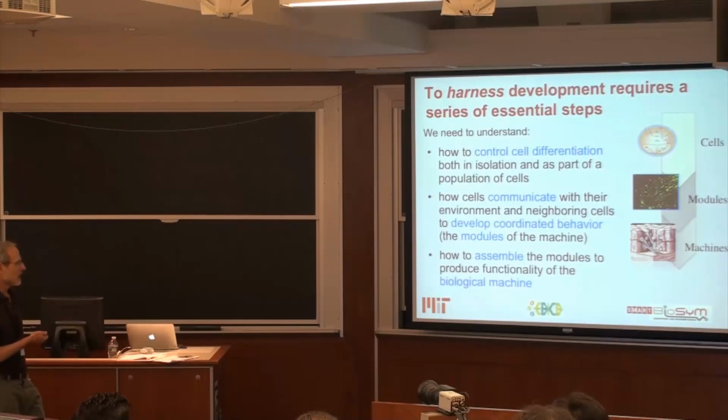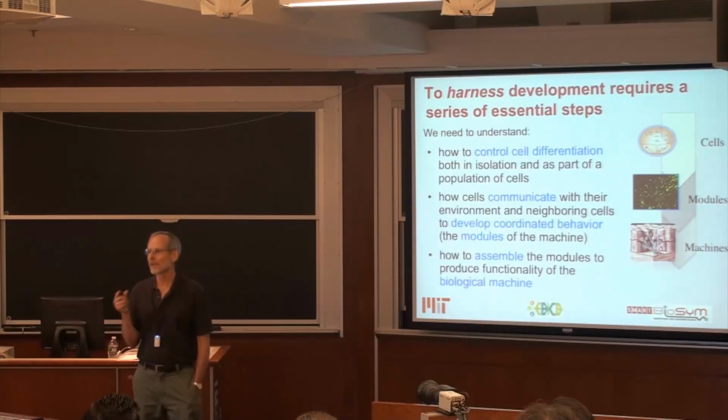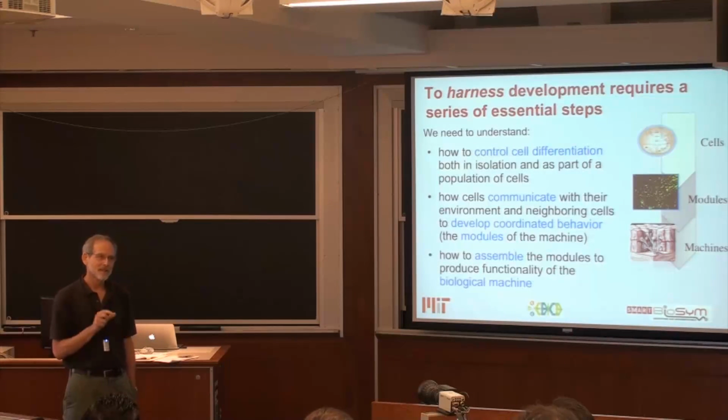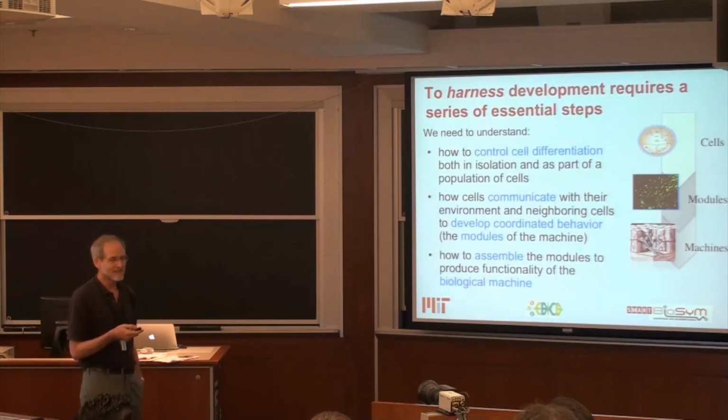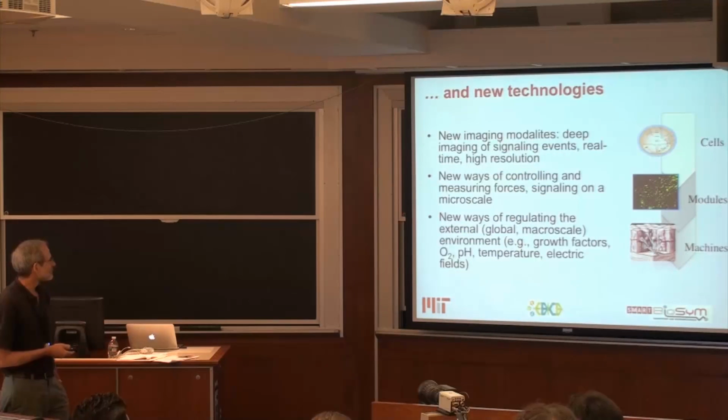What I can show you, maybe just a little bit in the talk today, is that we pretty much have control over these. I think we still have a long way to go before we can really assemble these in an effective way and have something that's functional, not just for an instant in time, but over the long term. The long-term stability of these organisms or organs is probably one of the major challenges that we face, because the cells tend to start to de-differentiate once they form the structure.